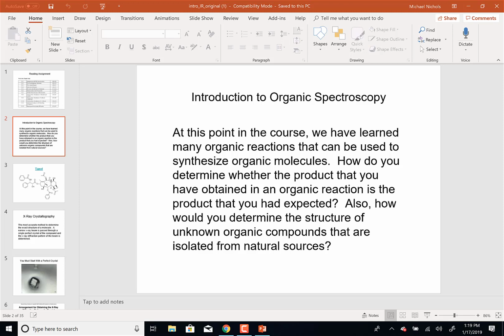Nowadays, with the instruments that we're going to talk about, infrared, nuclear magnetic resonance, which is NMR, and mass spectrometry, I can basically determine the structure of something that somebody just walks up to me and gives me off the street. They walk up to me, hey, here's a white powder, can you tell me what it is? And I probably can, using those different techniques. Before, it was very, very difficult. And I'll just give you an example of that.